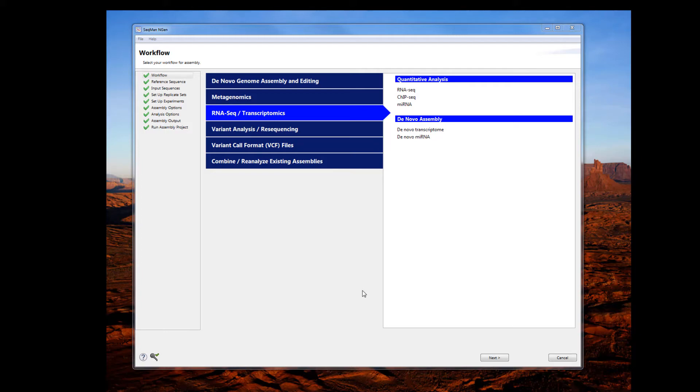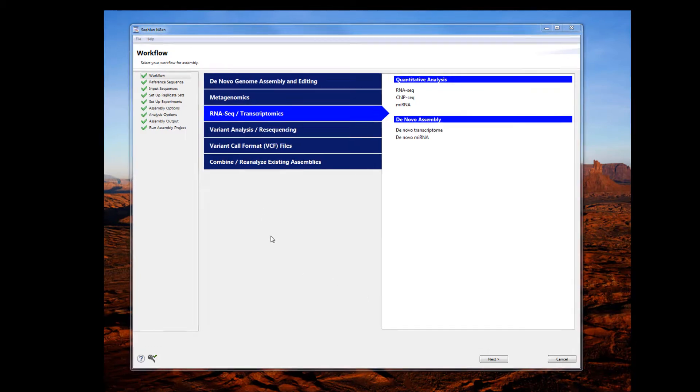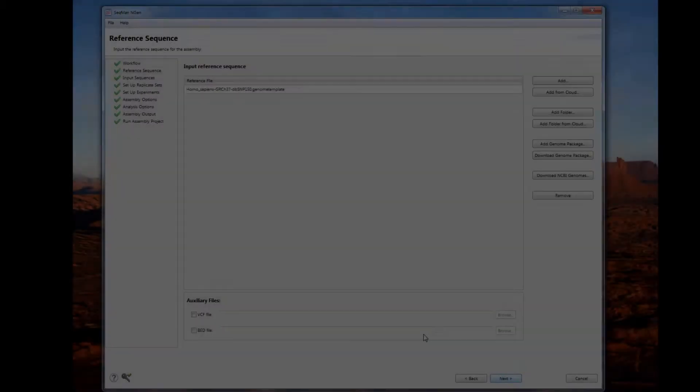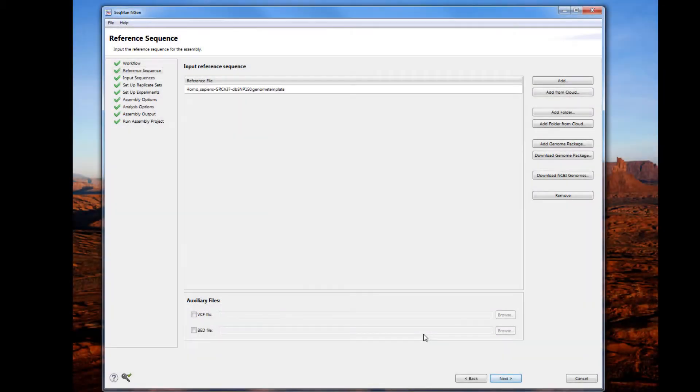In this video, I will demonstrate how to set up an RNA-Seq project using SeqMan Engine. Select the RNA-Seq transcriptomic section, then choose RNA-Seq under quantitative analysis. This will take you to the reference sequence page where you can import your reference genome sequence.